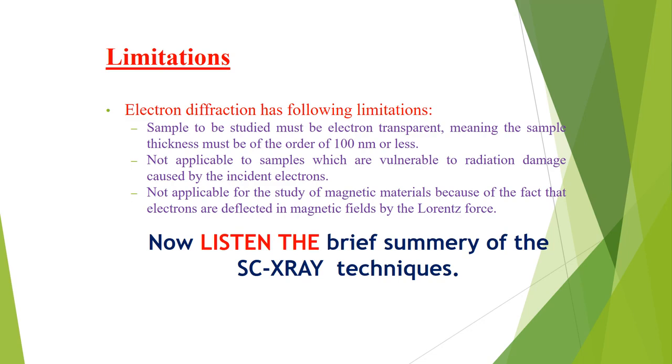The design challenge for single crystal diffractometers is how to determine the position and intensity of these diffraction spots. Laue versus single crystal diffraction: in Laue's method, a stationary sample is bathed with white radiation, that is, many wavelengths.